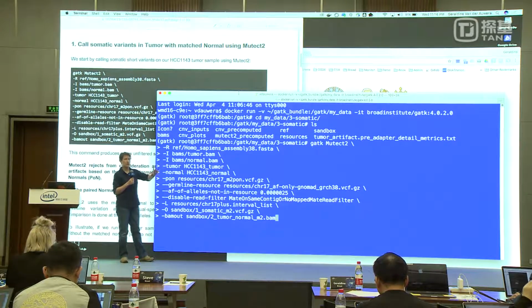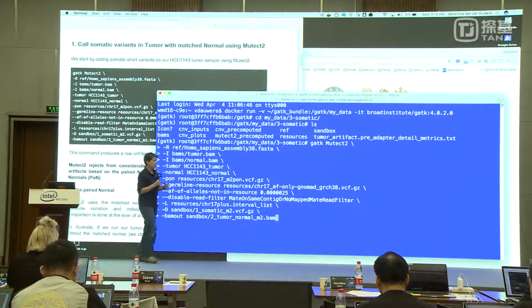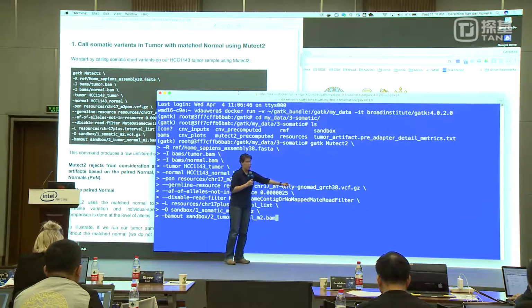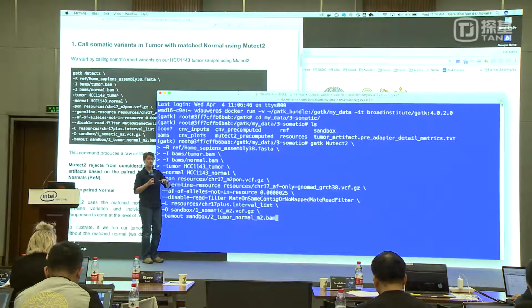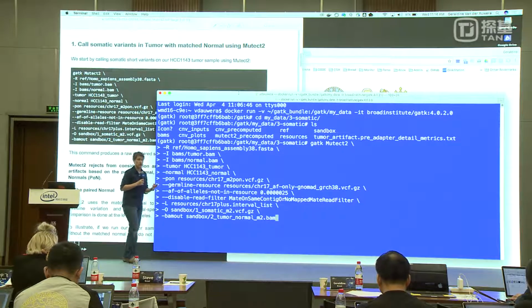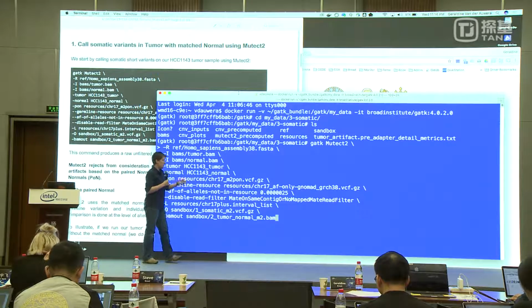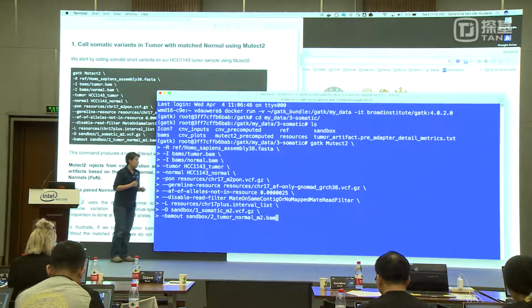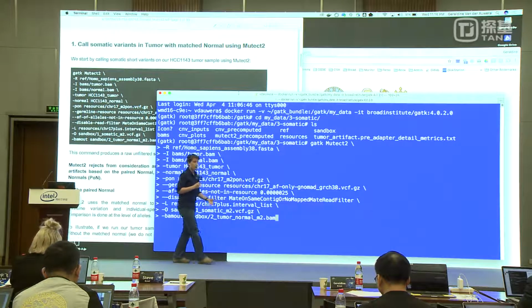That can be obtained by the rule of thumb equation that was given, which is that you're basically counting all the samples that are in your resource. You're counting how many samples are in my germline resource. Multiply that by 2 since they're diploid, and we're counting 2 copies of each chromosome. So we have 2 chances of seeing each allele in each of those samples. So for gnomAD, which has, at this point, we're working with exome, and in gnomAD there's about 200,000 samples at this point.